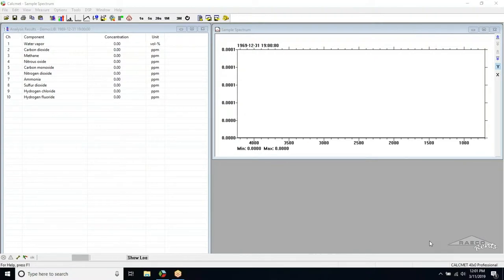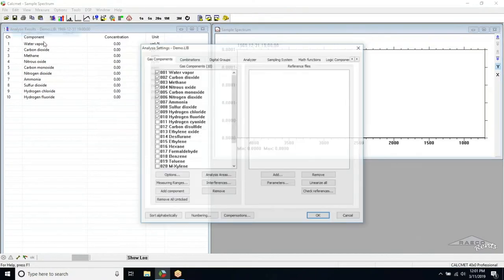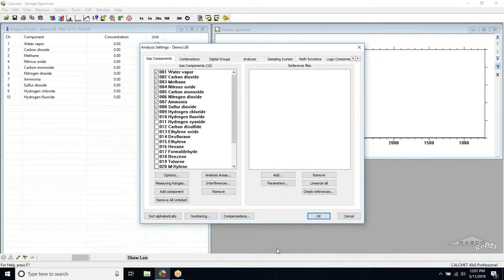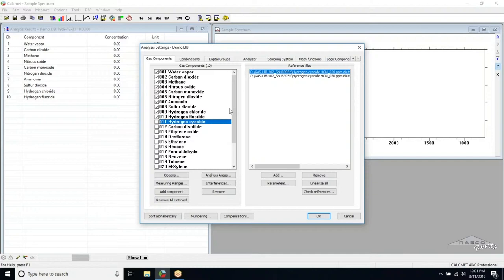The next step is to select the gases that you wish to analyze in real-time. This is done by navigating to Edit and then Analysis Settings. Next, simply check the gases that you wish to detect while unchecking the ones you do not wish to see. Up to 50 gases can be selected in this menu. When you have finalized your selection, press the OK button and you will see your list appear in the Analysis Results window.